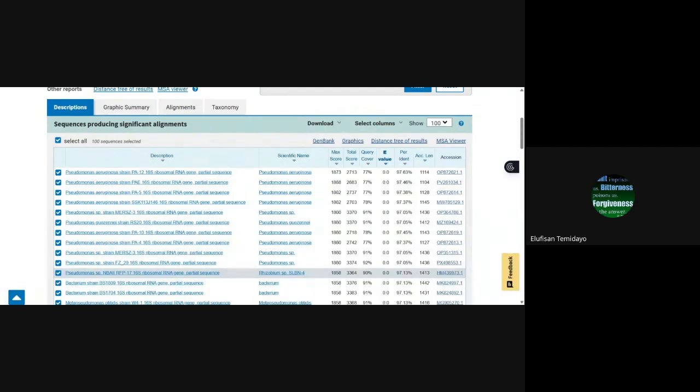That's the meaning. Many nucleotides are not the same, or the length is not the same. It depends. The length of the one I submitted compared with what it is matching to is not the same. So that's the thing that we are seeing. That's why the query cover is kind of varied. But the e-value is something to go with, because it's still within the range that we can trust.